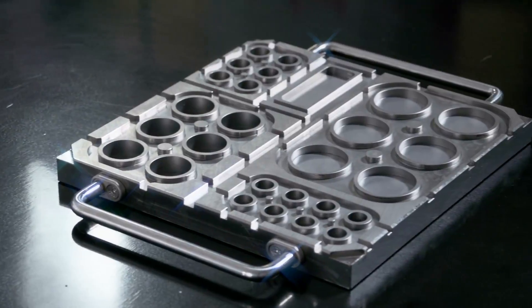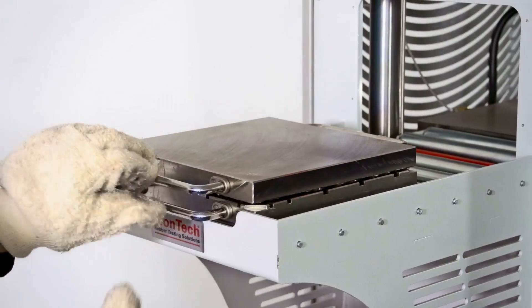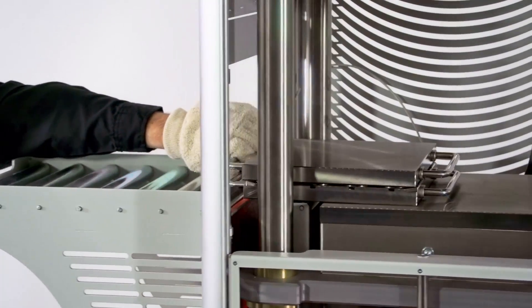The molds are made with precision from stainless steel and are equipped with a cover plate to meet parallelism and temperature distribution requirements of international standards.